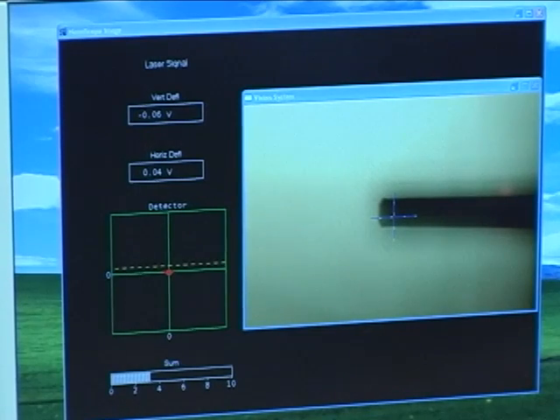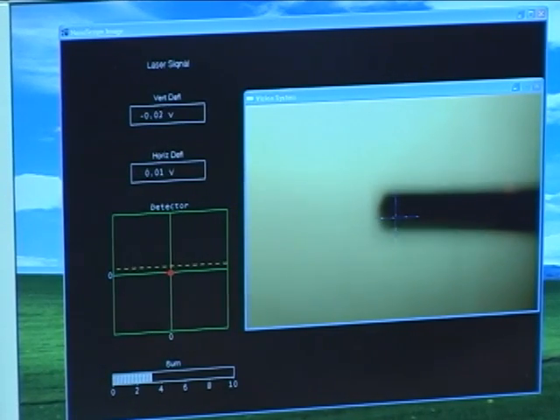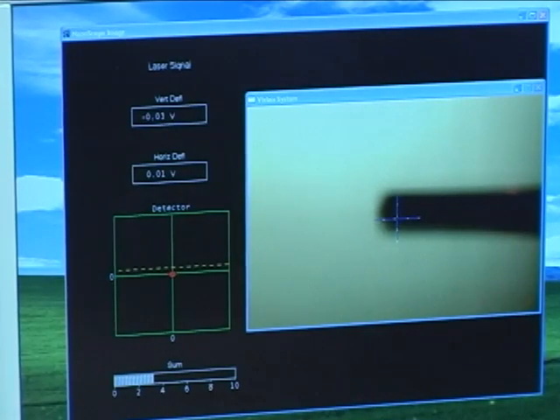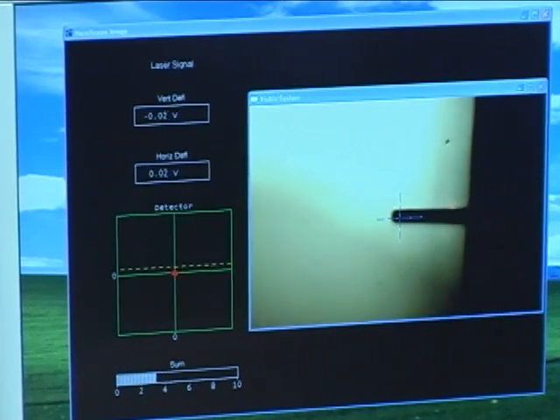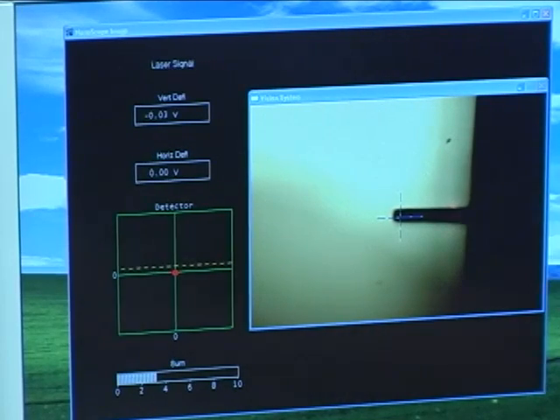Now to actually select a spot on the sample that we would like to image, we can switch back to the surface mode or surface focus mode and the microscope will adjust itself such that you should be focused on the surface. And we're pretty close. You can see here there's a fleck on the surface. So I might fine tune my focusing to bring that into good focus.